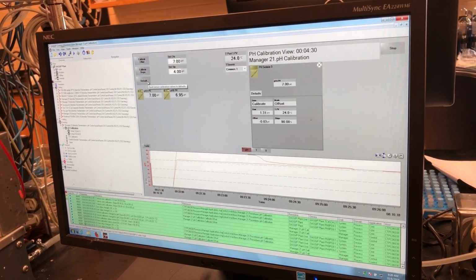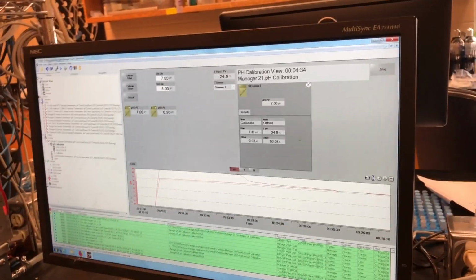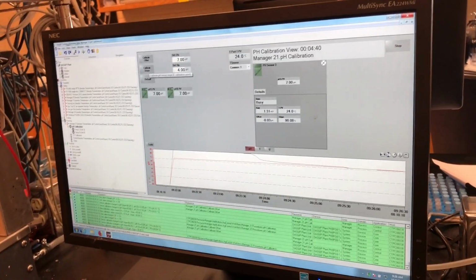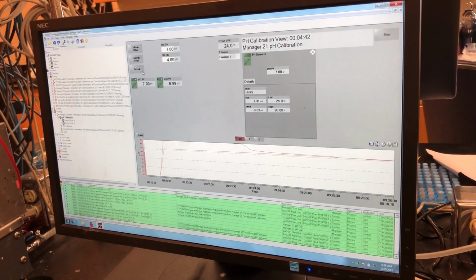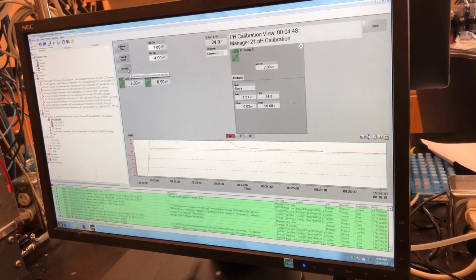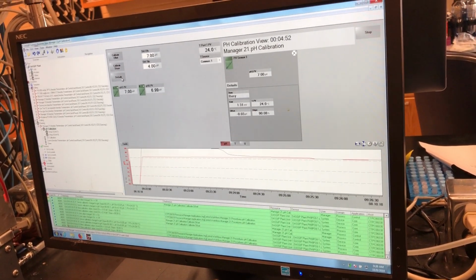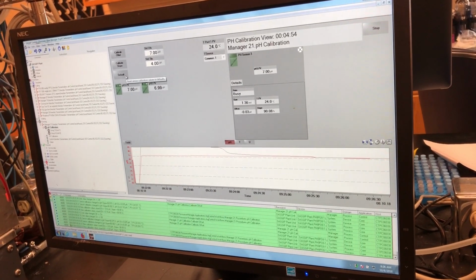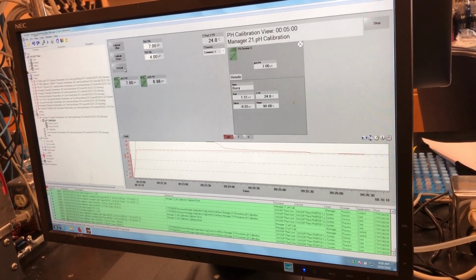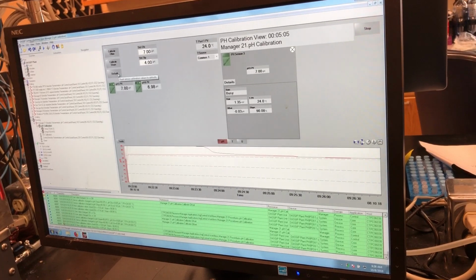Also, about 7, you said okay. Where do you accept it? So if you hit calibrate offset, it'll set your pH value at the offset value. If you go onto your next buffer, then you can hit calibrate slope, and it'll set it to that next buffer value. Okay. If your probes are not working as they should, you can hit default, and it will reset the values for the readings to the default values. It will basically remove all calibration from the probes. If you can't get it to work, it's worth a try. You can just try hitting that and see what happens.